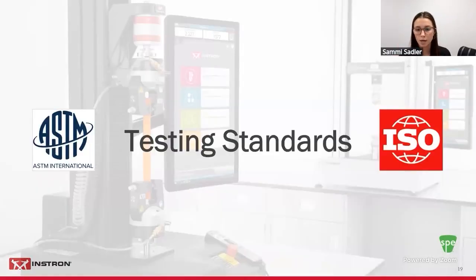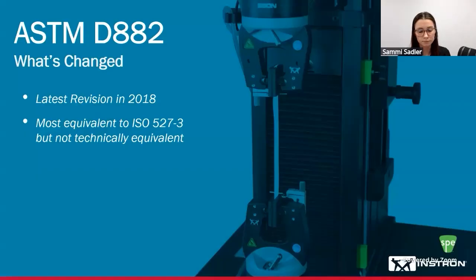The last section we're going to cover today is testing standards. The most popular testing standards haven't significantly changed in a way that will impact your current testing, but I do want to go over some noteworthy updates that we've seen in the past couple years. ASTM D882 for thin film testing went under revision back in 2018. This isn't necessarily recent, but it is still important to note the changes that we saw from the 2012 version to the 2018 version.